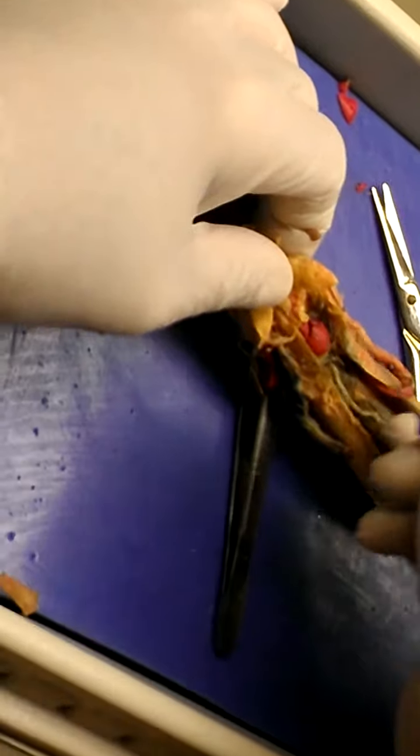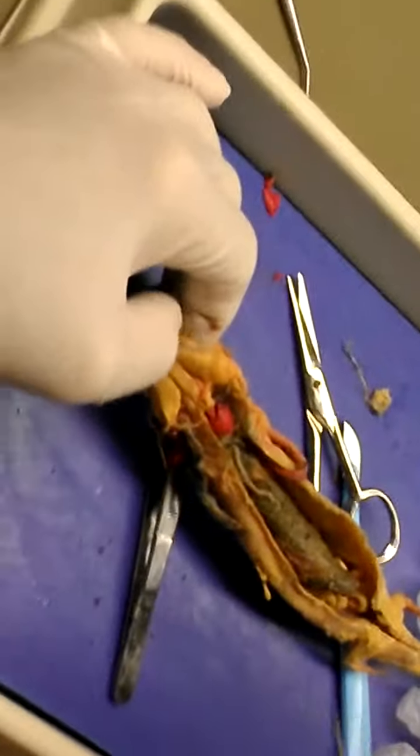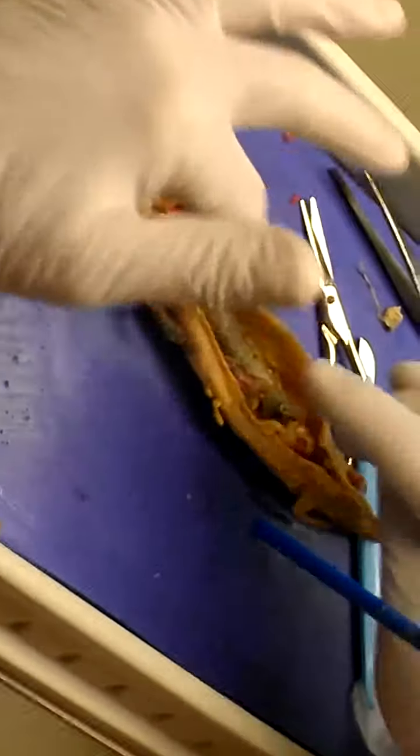Okay, all right, this swelling at the front end of the aorta there is called the bulbus arteriosus. It's the part that actually is your distensible aorta. Okay. All right. Now, when you go to do this, so the guts are really easy.